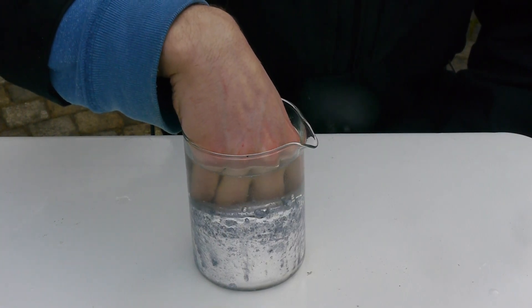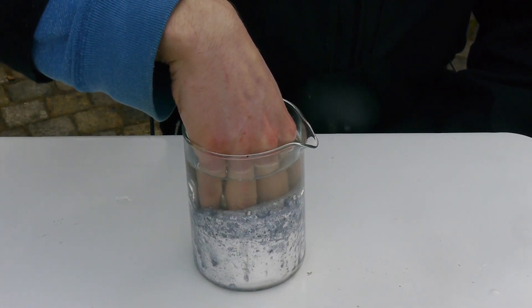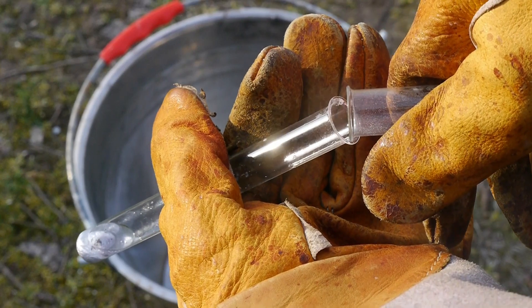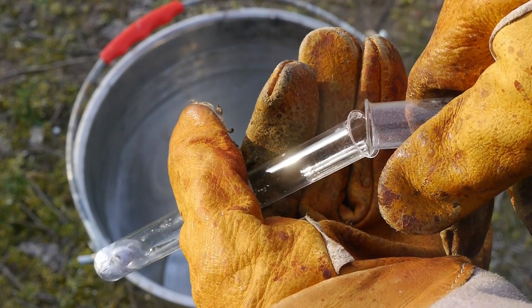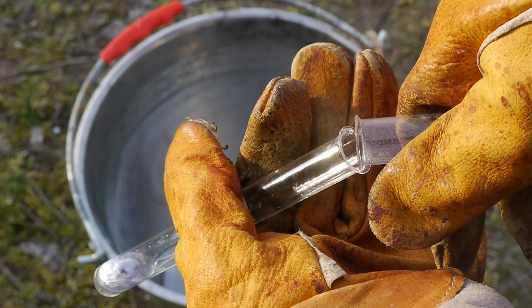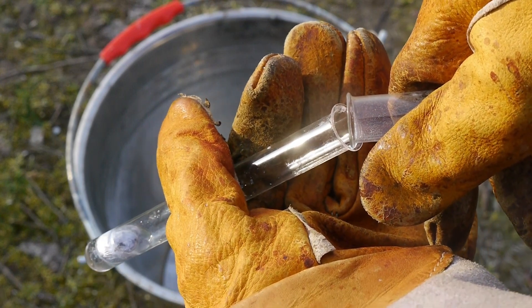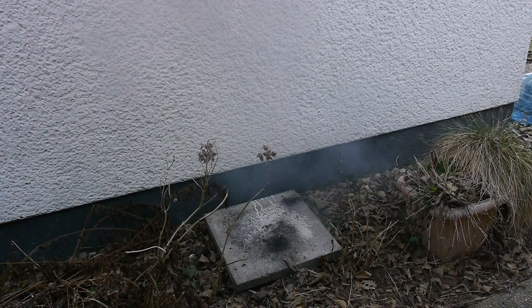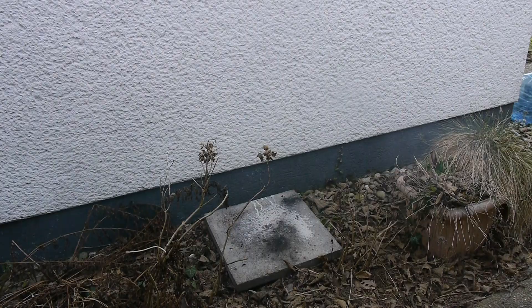In the previous video, where I burned my hand with another highly explosive metal, I showed how it reacts with carbon tetrachloride. Immediately upon mixing, nothing happens, but if you drop it from a high place, like a roof for example, it makes a bang so loud that all the walls are shaking.